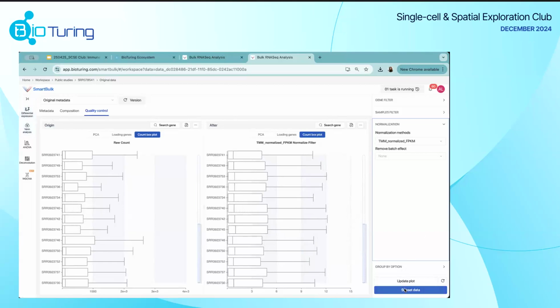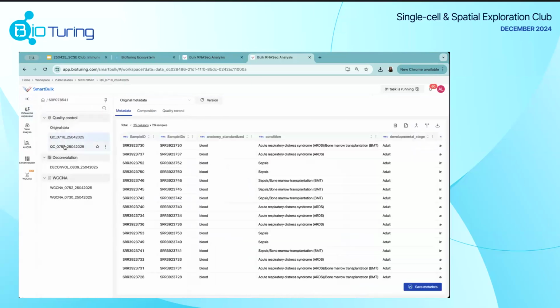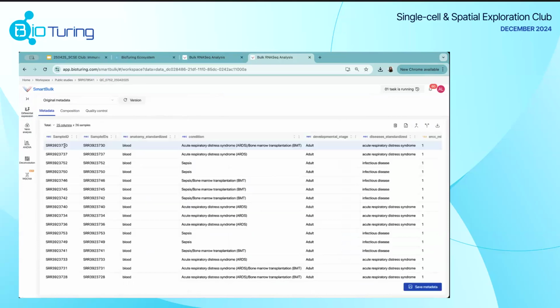So that creates a new copy of the original raw matrices, so that you have the normalized sample data set that you're going to work with when you're applying all the different functionality analysis. Okay. So I'll go here and you'll see that this is my original study, the non-QC original data. And here I have these different normalized data sets that I'll be using for the downstream pipelines. Okay. So I'll go back and I'll select the last normalized data set so that you're able to see it.